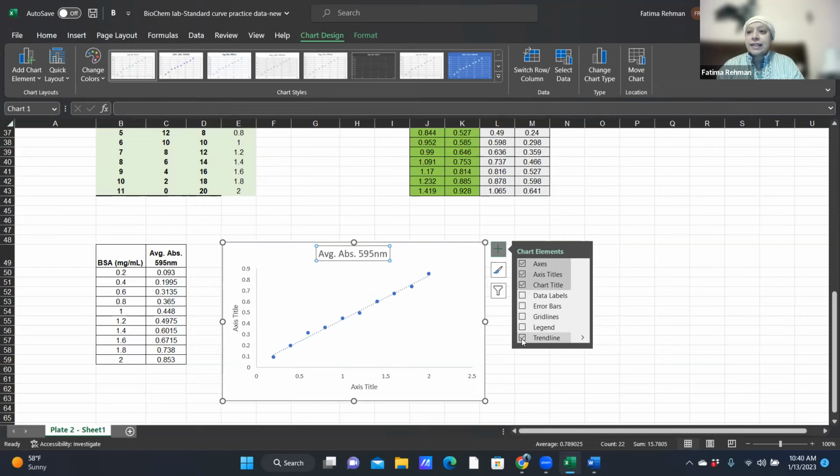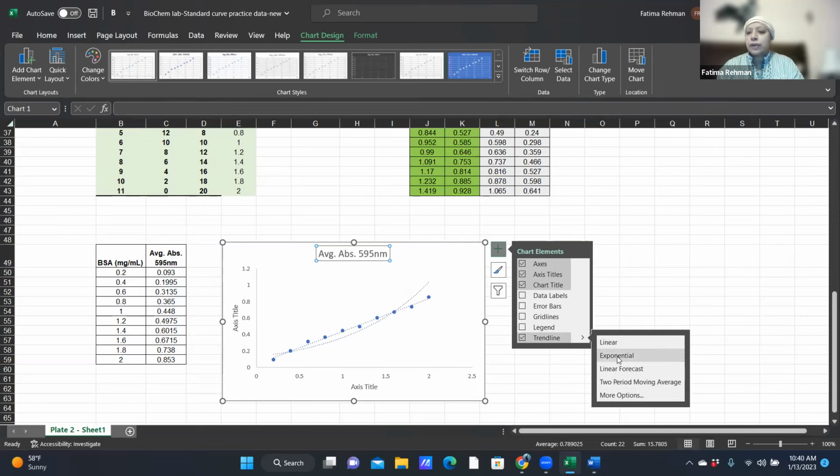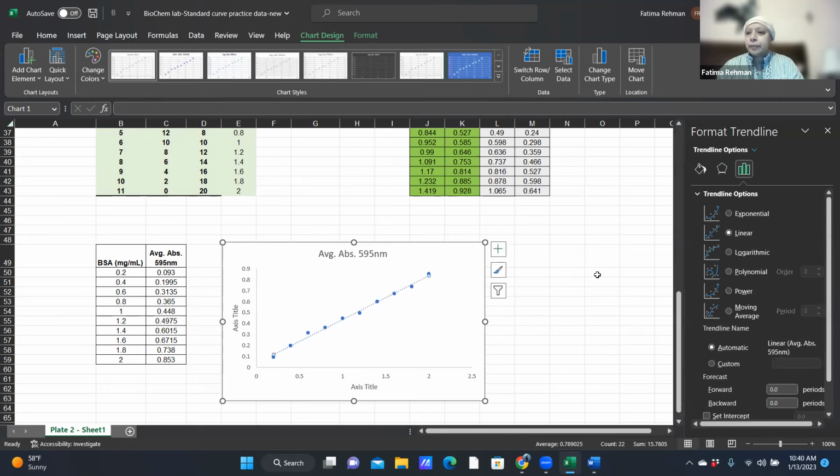Now you're gonna have the same graph 3 times, each one with its own trend line, because we're gonna do all types of trend lines. This first one is a linear trend line. Then you're gonna do one with exponential or logarithmic, and then one with polynomial. Okay.